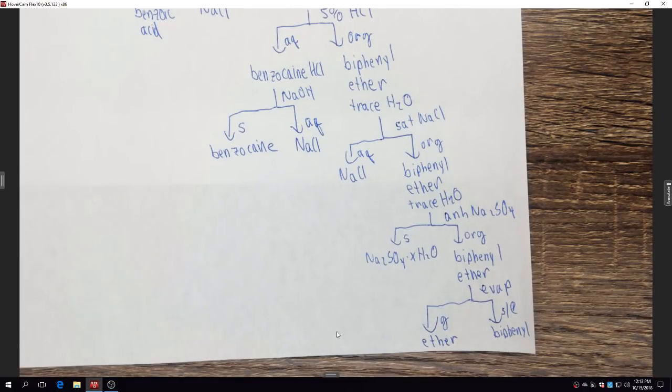All right? So essentially carboxylic acids, how do you get them out of the organic layer? And amines, organic bases, how do you get them out of the organic layer? It'll help you out a lot.